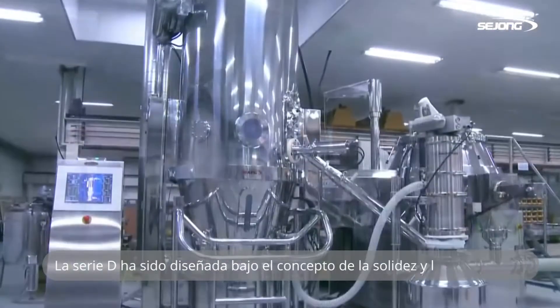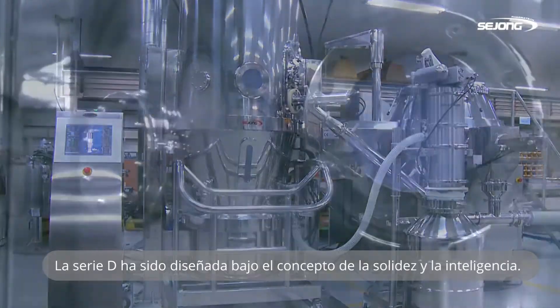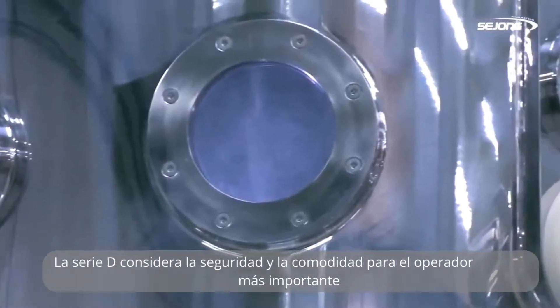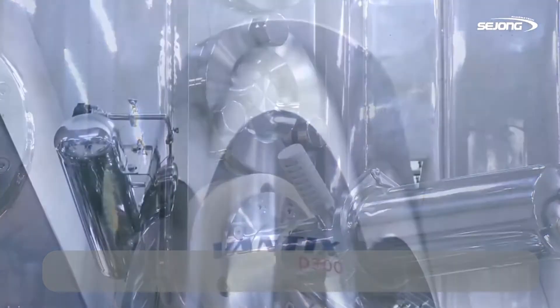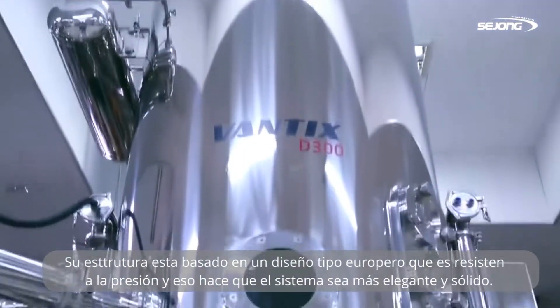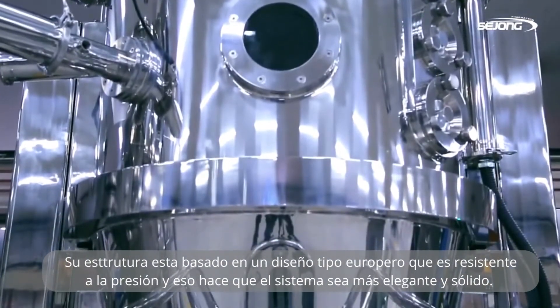D-Series has been designed on the basis of the concept of solid and smart. D-Series considers safety and convenience for the operator as the most important thing. It is based on a European type of pressure-resistant design, which makes this system more stylish and solid.